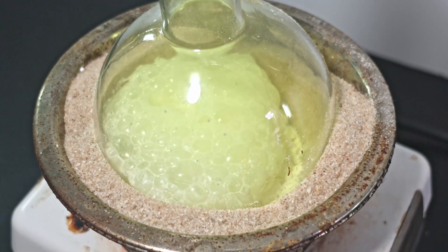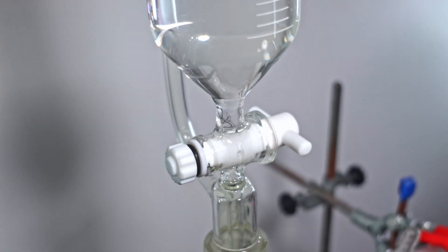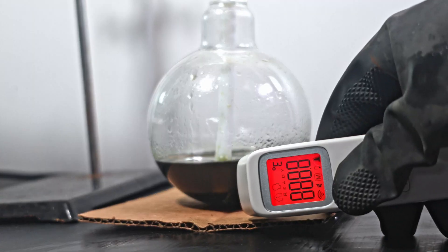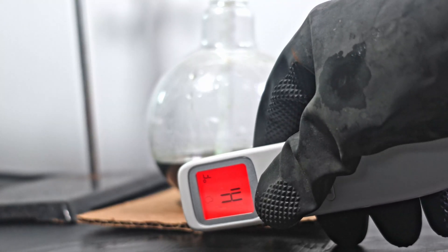Chlorine evolves quite quickly despite the steady drip rate. I eventually do close the funnel for a bit. When dripping slows, I take the temperature. As you can see, it has gotten quite hot.